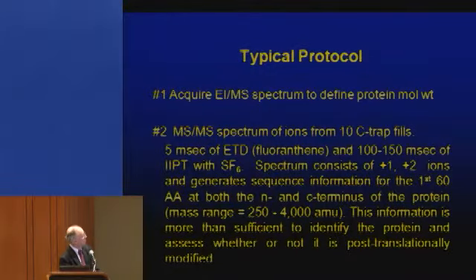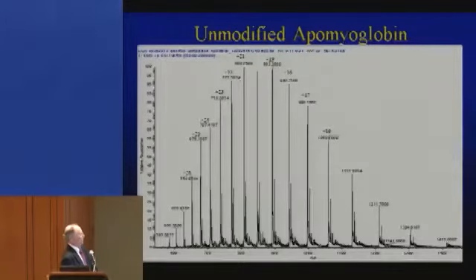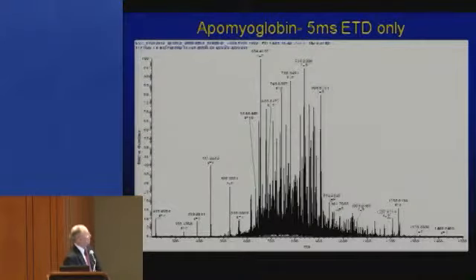So here, let's go see what it looks like. That's an electrospray ionization spectrum of apomyoglobin, and we're going to play with this +25 ion here. We can pick any one or multiple ions to play with. I'm just going to illustrate it with this one at 679.